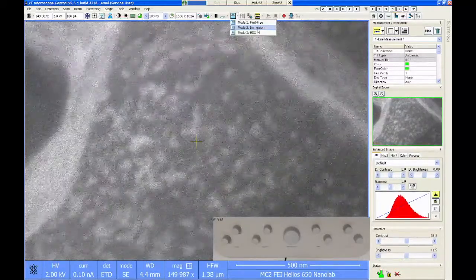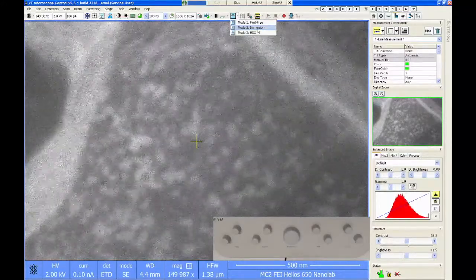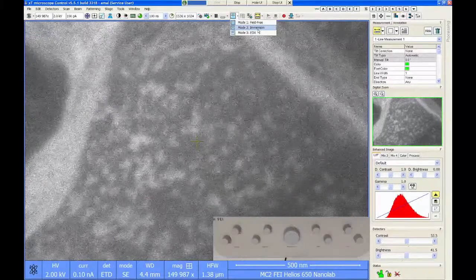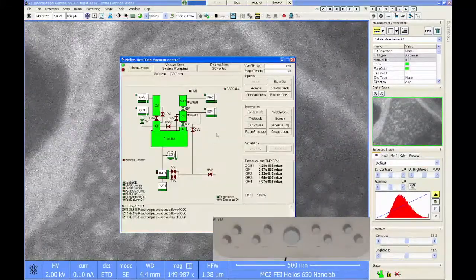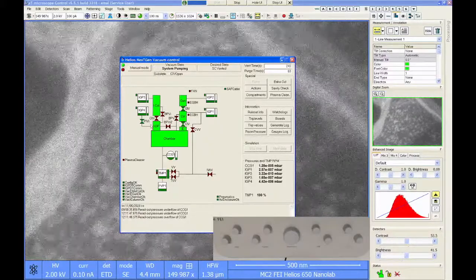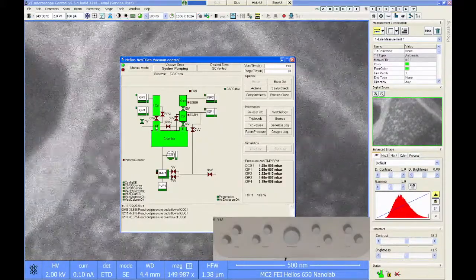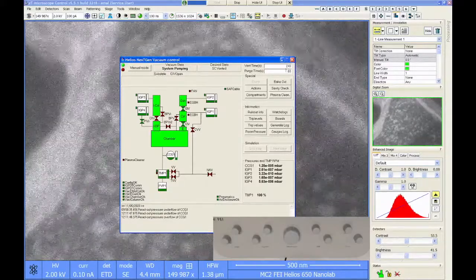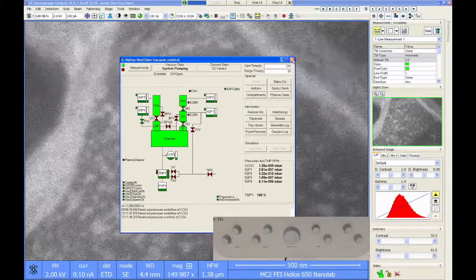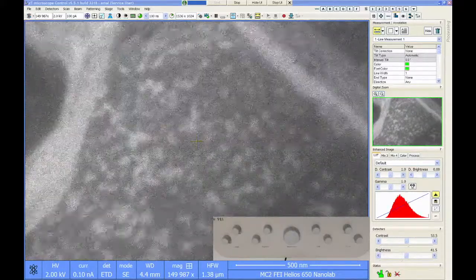samples. And just as a side, because you guys asked about this earlier, that valve just popped open that I mentioned, the IGP-4 valve, I just heard it go. So if I go look at my vacuum page, you see here that valve is now open, the bypass is closed, and the differential pumped region on the ion column is now green. So I don't know how long that took since we pumped the chamber down, but maybe about 45 minutes, I would guess.